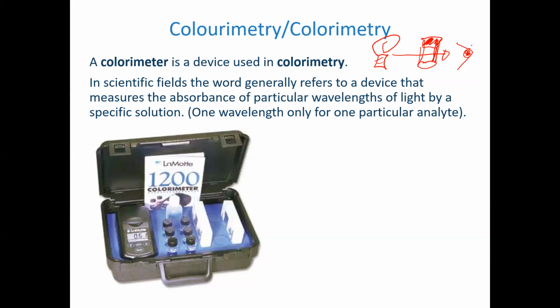Light is going through, and it's trying to detect how much light is going through. And in the case of the fluoride, I don't really know what the compounds are added, but the solution looks pinkish in color, and the instrument is pre-calibrated to read fluoride only in this case of the instrument.